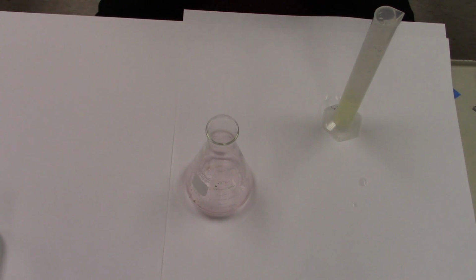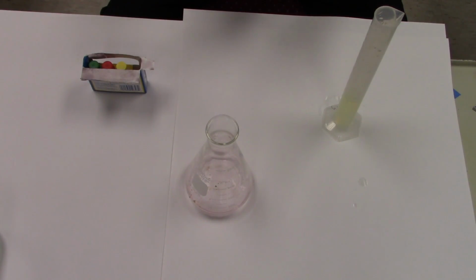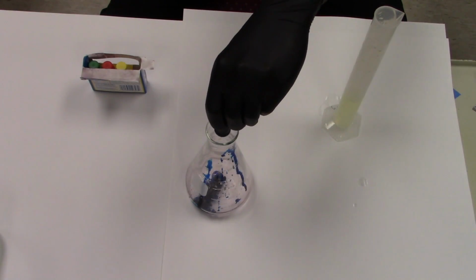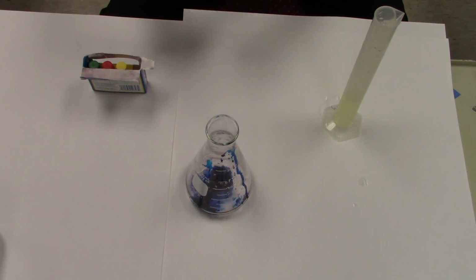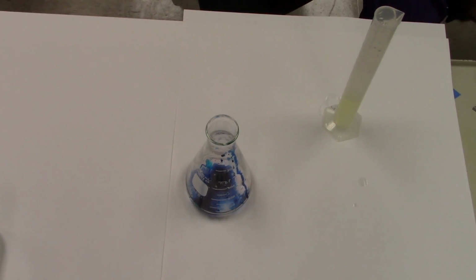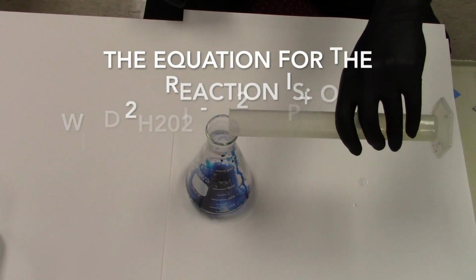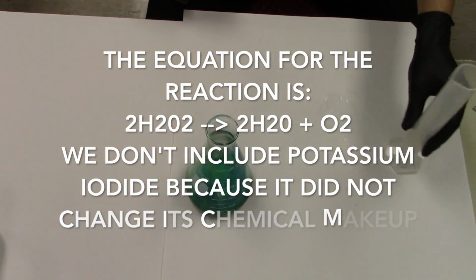And I'm gonna add, what color do you want? Blue, yellow, red, or green? Green. Not blue. I did green last block. Not blue. Look at that. Well, whatever, that'll work. It kind of got all janky on me. Anyways, 5, 4, 3, 2, 1. Ta-da!